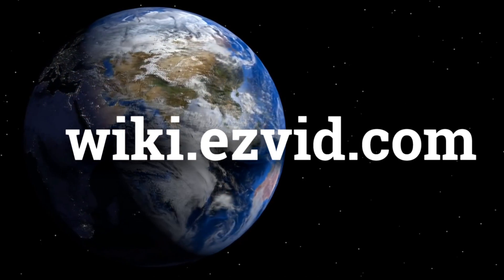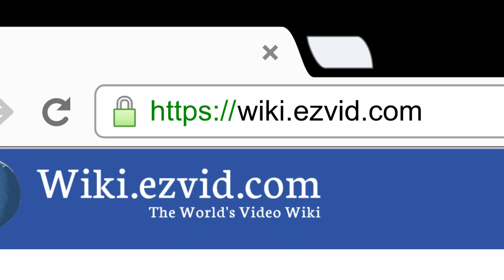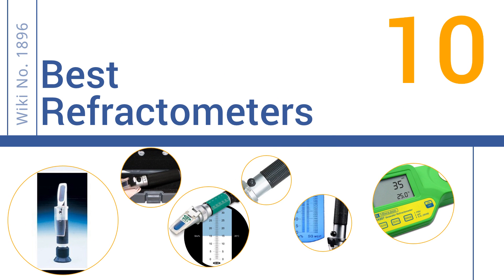wiki.easyvid.com. Search EasyVid Wiki before you decide. EasyVid presents the 10 best refractometers. Let's get started with the list.